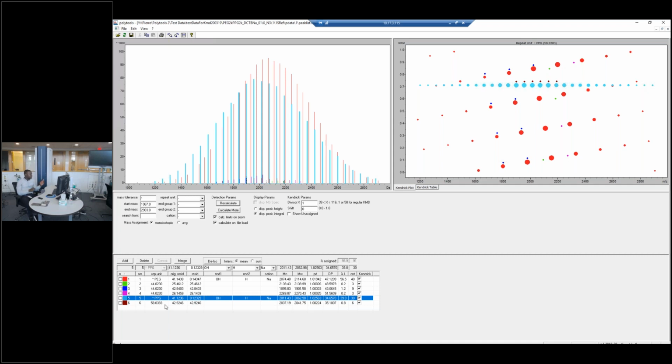But there is a NIST library or link that I can share with the interested person. It's usually MALDI.NIST.gov that has quite a plethora of different types of sample preps and conditions for most of the polymers that have been analyzed up to this point. For something such as PEG or polystyrene, that should be pretty easy. There's quite a lot of choices, such as you can use DCTB or Dithranol for polystyrene and things like that.